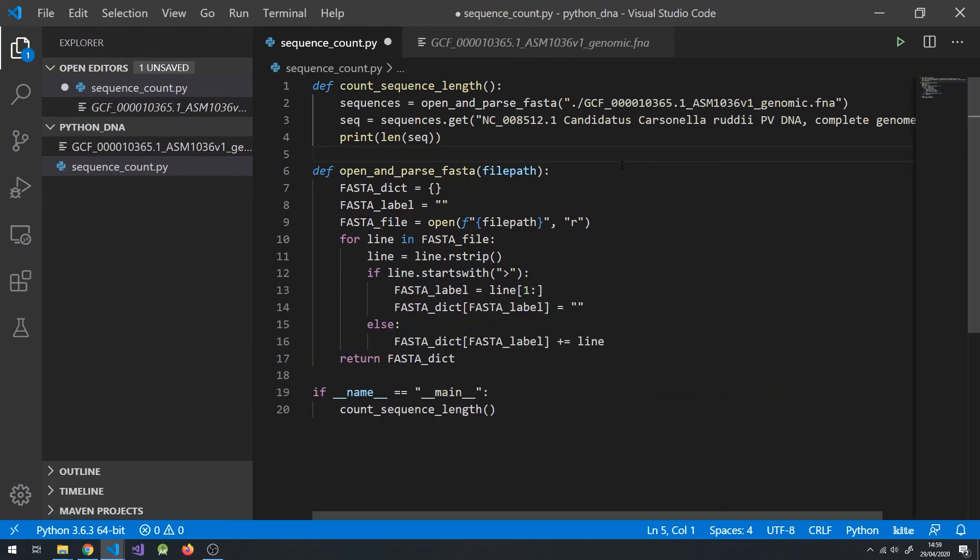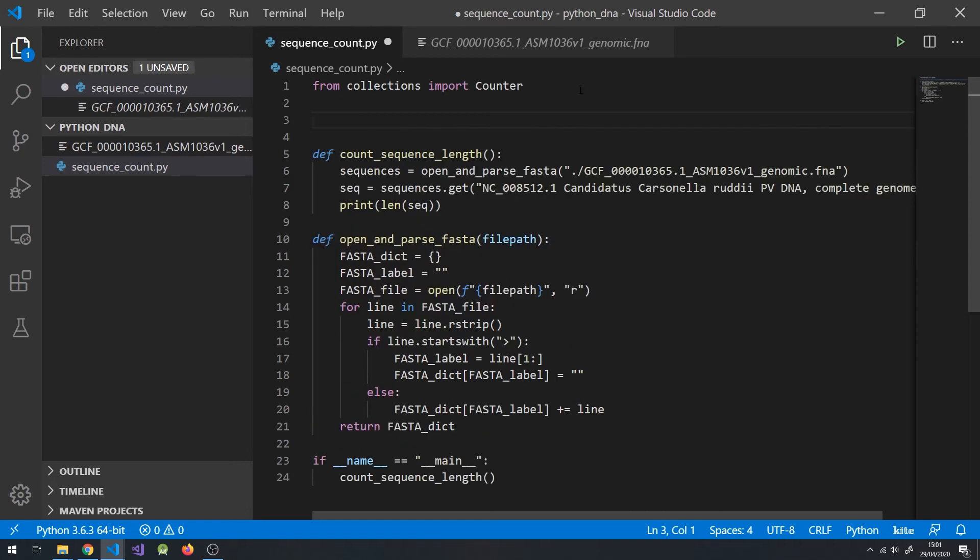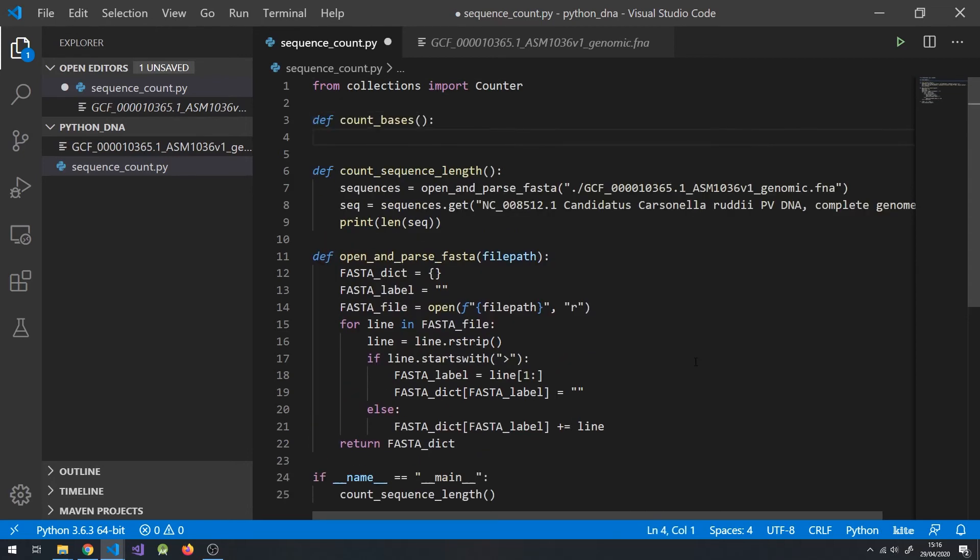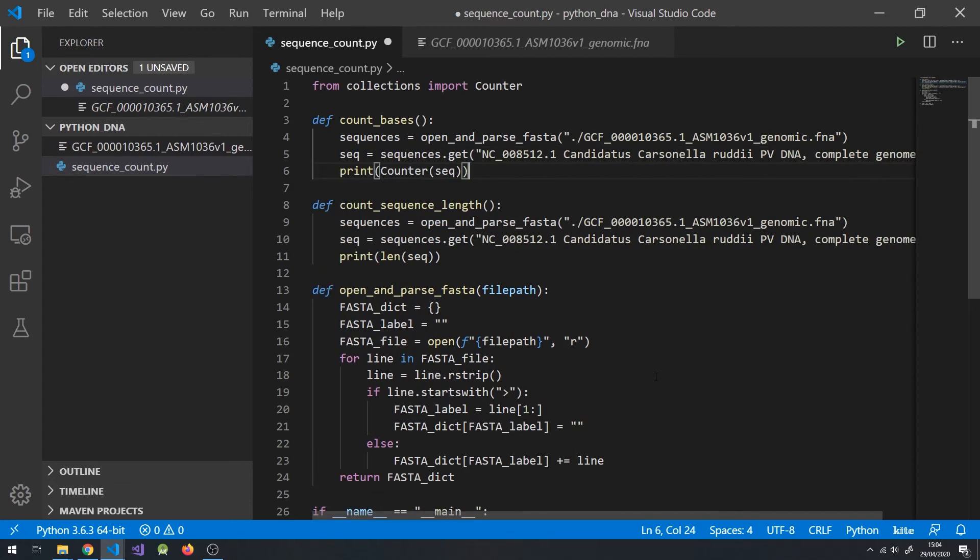Here's a quick function that counts the frequency of bases in a sequence. First, from the collections library, import the counter function. Next, we define our new function. Then, reuse these same lines here. And finally, call the counter function on sequence and print out the result.